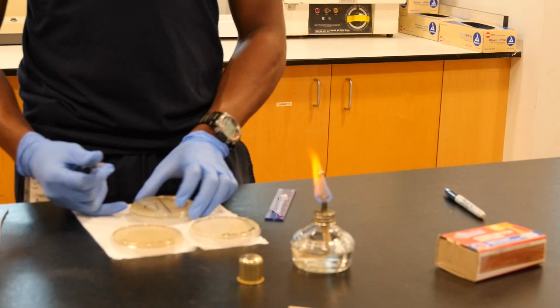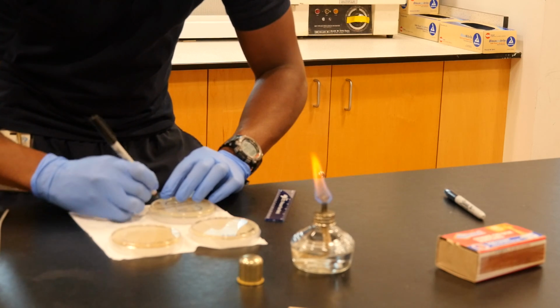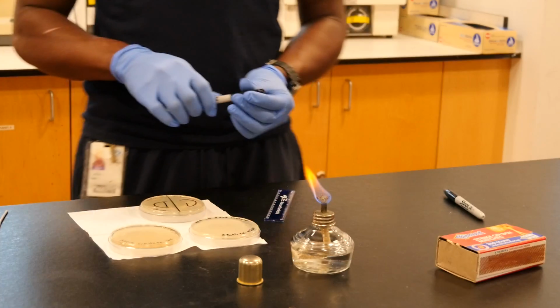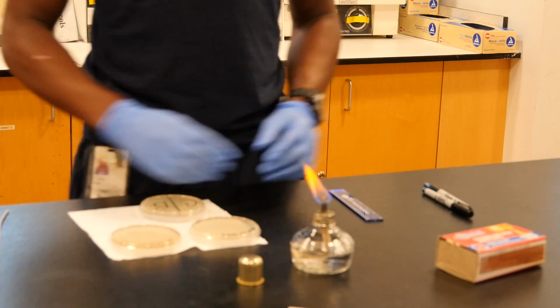With the fine marker, we're going to have to place our initials. We need our initials, which is AF, which is me, and the date that it is actually being done, okay? And you do not erase anything else. You just place that date and the initials and keep the other information on there for past purposes.